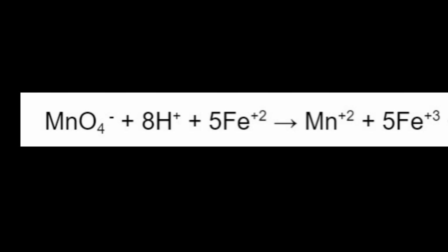Theoretically, the titration will follow this chemical equation. See if you can identify which reaction is oxidation, which reaction is reduction, which of the reactants is the oxidizing agent, and which of the reactants is the reducing agent.